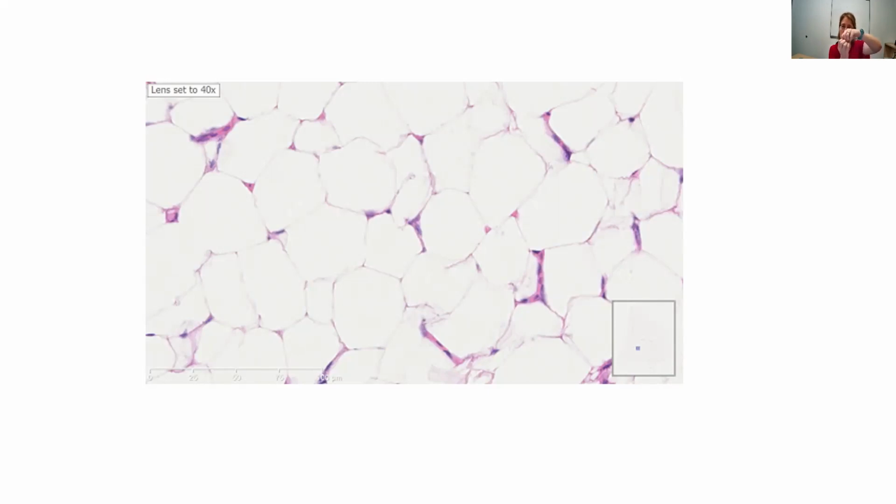So I could have all these balloon-like cells meeting. Just like if you take a bunch of balloons and hold them right by the openings that have been tied off, you can see those openings. On this, that could be what this is here, where I have all these balloons with their little openings, or maybe it's a whole bunch of diamond rings coming in from one way. And this is really thin. This is a really thin cellular membrane.